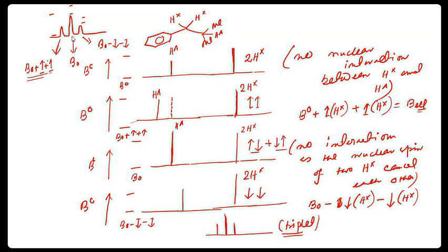After that, from the next class, after learning something, we will try to explain structure determination by NMR. Which kind of structure determination? Is it cis-alkene or trans-alkene? That I have explained in terms of infrared spectroscopy. Now we'll explain it in terms of NMR spectroscopy. For example, is it axial form or equatorial form? We can explain it from NMR.